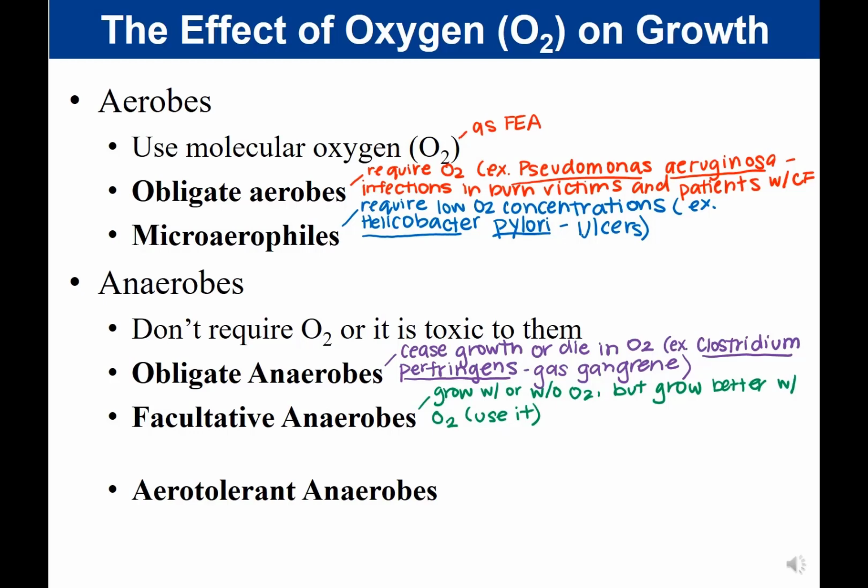So for these organisms, they do use oxygen. However, they don't require it. And so that's why I wrote grows with or without oxygen, but grow better with.